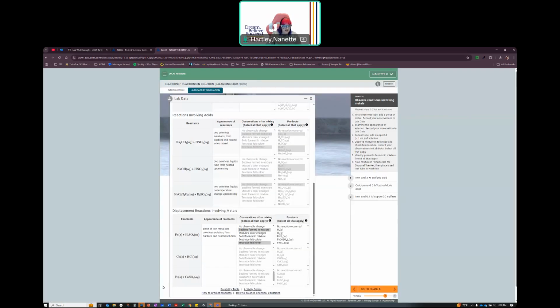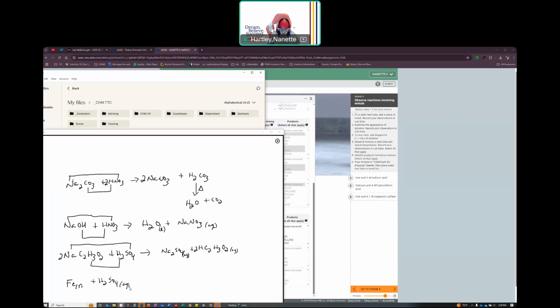So if I look at this, I see that I have Fe plus H2SO4. So what I should be seeing is FeSO4 plus H2 gas, something along those lines.